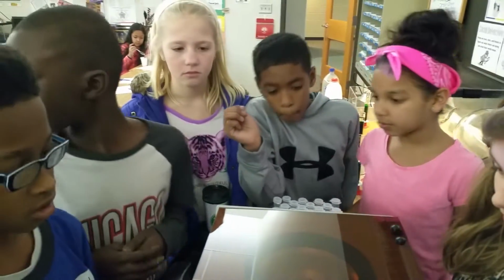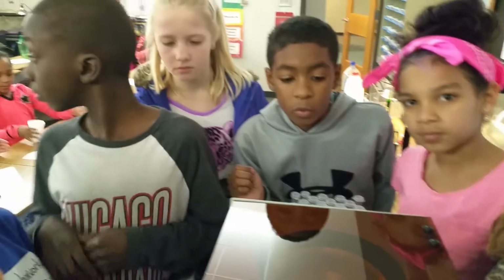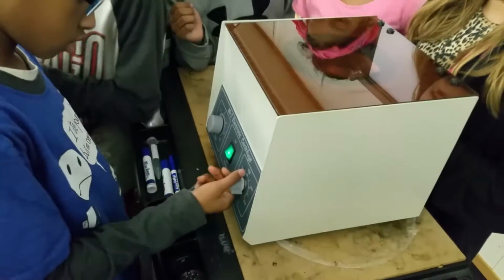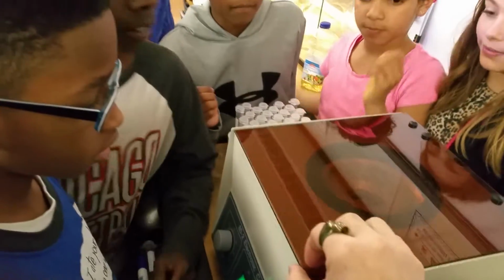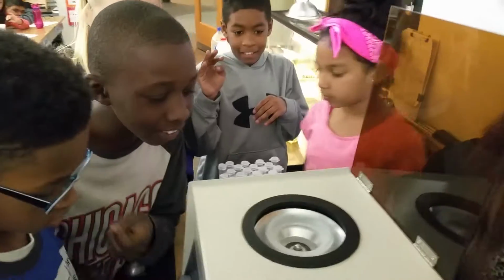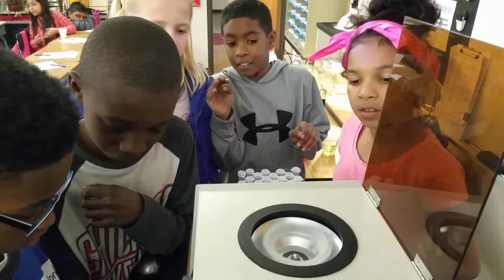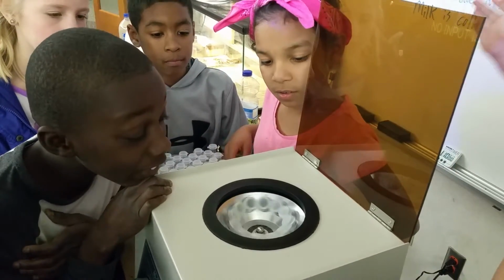And you can see the centrifuge is spinning your test tubes around. And it's forcing the sand toward the outer end of the test tube, toward the bottom of the test tube. Okay, Jerome, you can start turning it down. There you go. Let's check. Go ahead and turn it off. Okay, don't touch it till it comes to a complete stop. There you go. Slowly, not yet. No, wait. Come on, man.